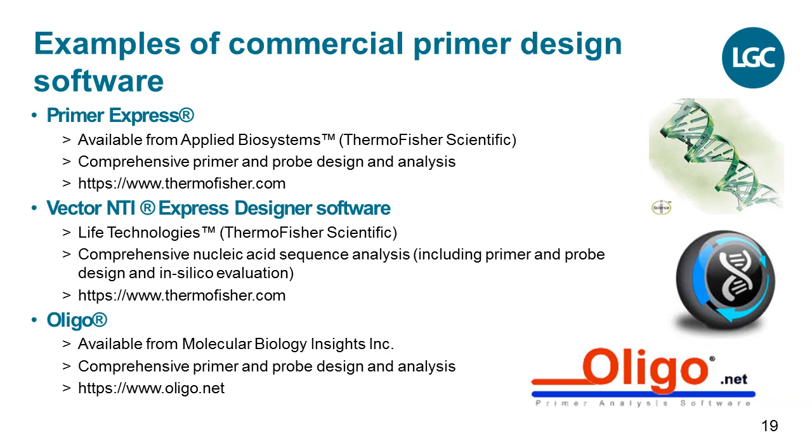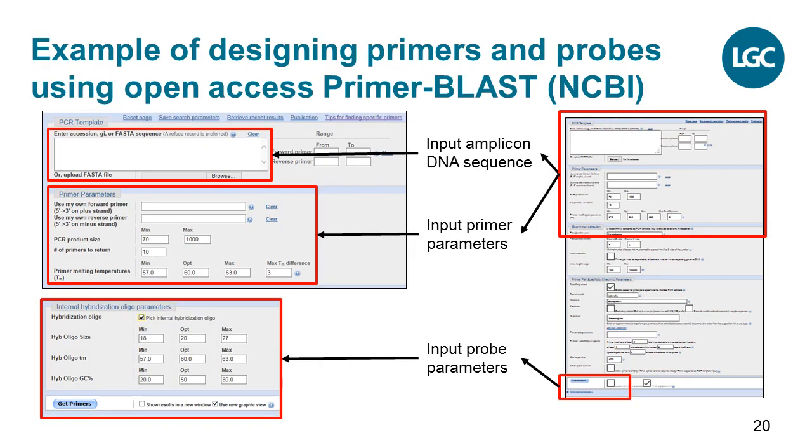Biology Insights. The current slide illustrates the oligonucleotide input page of the web-based interface for the NCBI's Open Access Oligonucleotide Design Tool, Primer Blast, as accessed on the 3rd of July 2018.